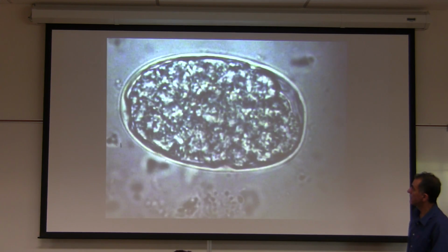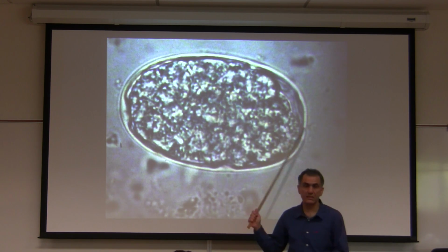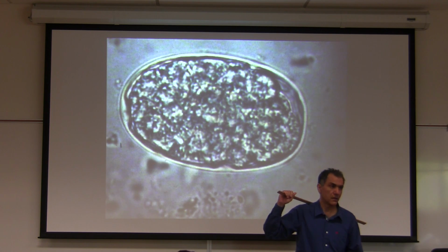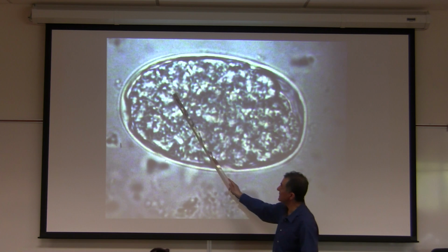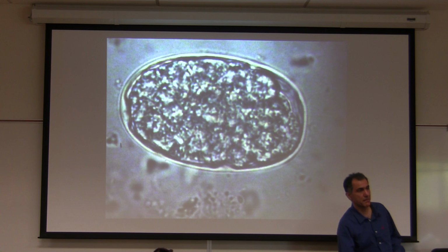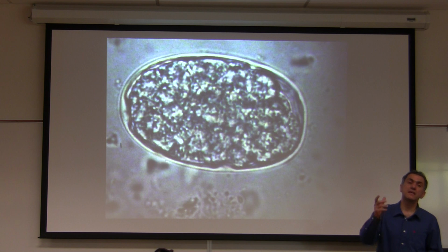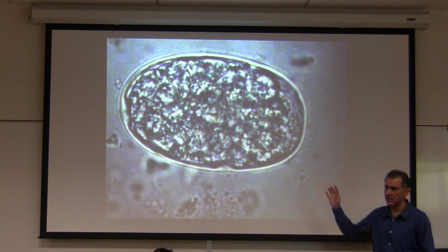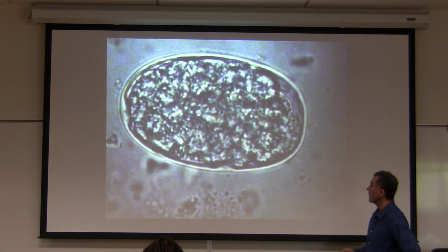Pinworm, is that right? Talked about. Well, okay. You do not have a slide of this, but what is this egg of? Hookworm. This is a slide of it. This is a hookworm egg, and inside of it is a morula. You remember at the beginning of the semester we talked about the morula. These are all cells. This is a morula. Very thin shell. They cannot stay in the environment for a long time. Hookworm eggs need a moist environment. Unlike the Ascaris eggs, which can stay in the environment for a long time, these cannot. They need water, they need a moist environment, and soon become larvae.